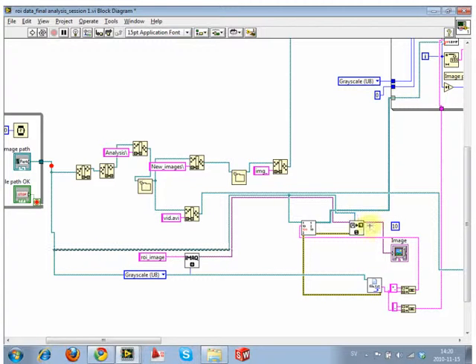But I know exactly where the problem is. It's right here. No, that's not the problem either. I apologize. This is pointing to the file. Normally the issue is that this is selecting a folder and not a file, but this is selecting a file, so that one's fine. So that's not the problem.